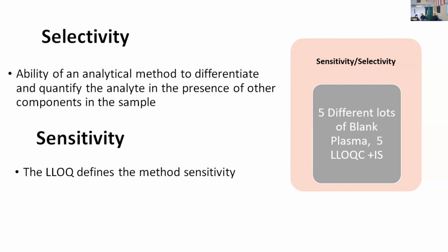I have not discussed the stability parameter here because it will be a lengthy procedure, but it has the same values. The accuracy was determined in many conditions like the freeze-thaw condition and the autosampler condition, but the acceptance criteria remain the same. So that's all from our side.